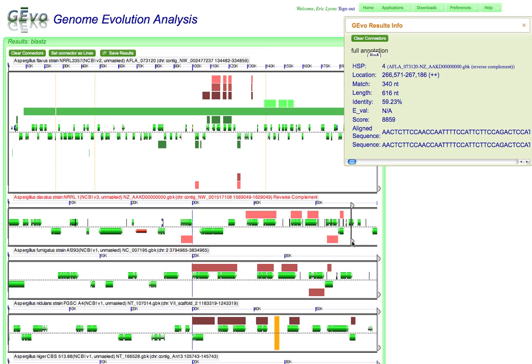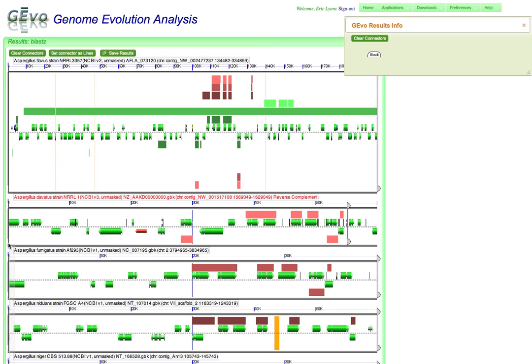You can use these slider bars at the ends of each one of these genomic panels in order to narrow in on a particular genomic range.